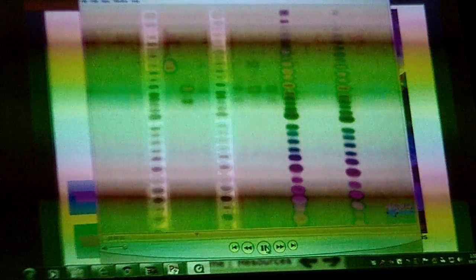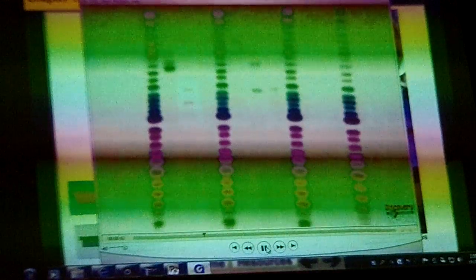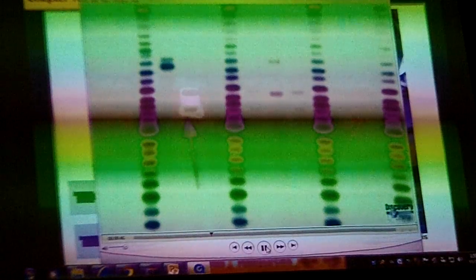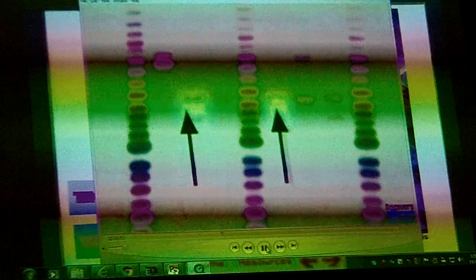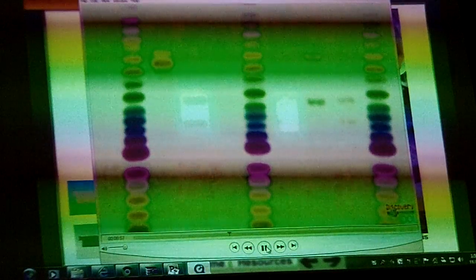The black bands show the pattern of chemicals that make up the rungs of an individual's ladder of DNA. This sample was taken from a violent crime scene. And this sample came from a suspect. If the two match, the suspect will most likely become the accused. Unless a sample's contaminated, DNA doesn't lie.